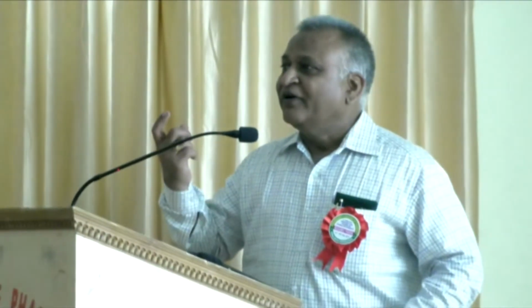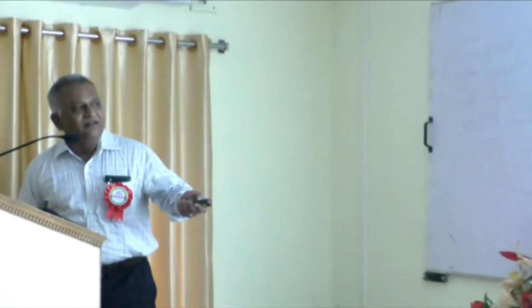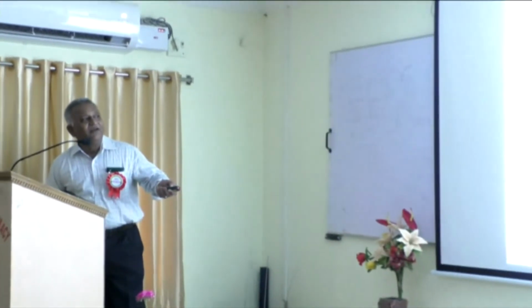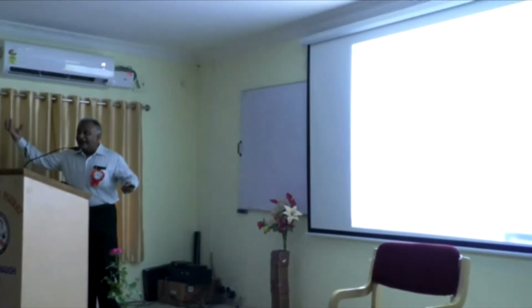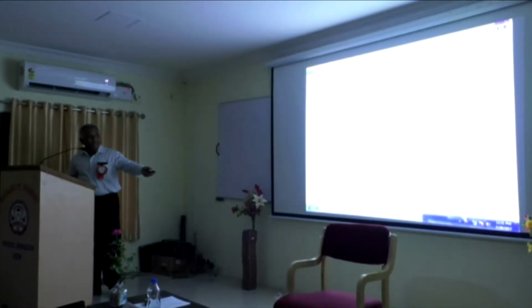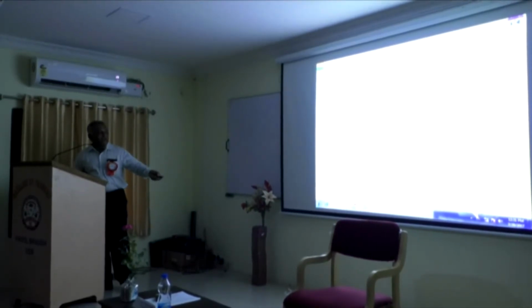Next slide. Yeah. What we did further is we employed NMR to find out where the added ion complexes. So here this site is the complexation site. Why this site of the complexation? Where those protons are getting affected, the surrounding protons are getting affected. Therefore, this is the site of complexation. So when you add the cation, it goes and binds at this space, and then that will change the NMR signals, proton NMR signals. You can see it here.